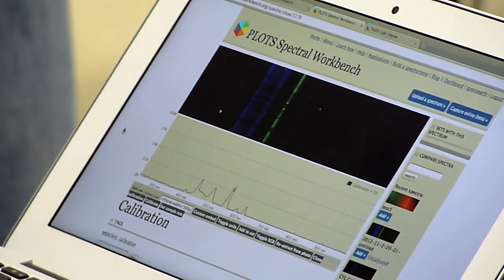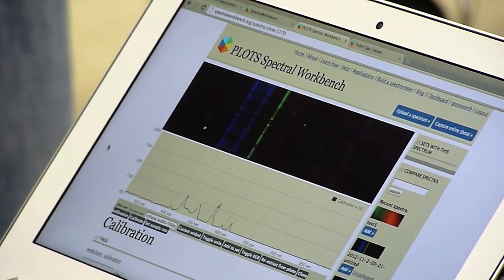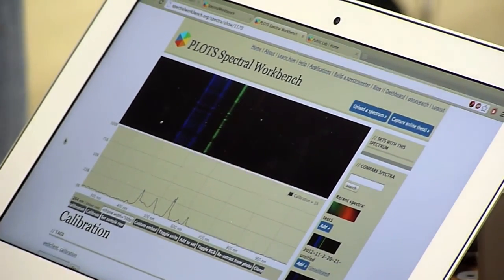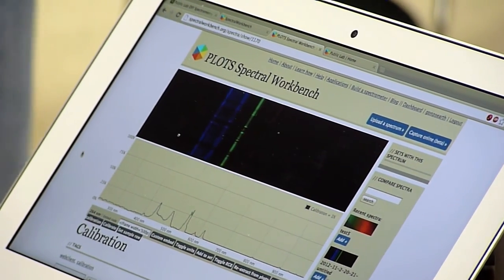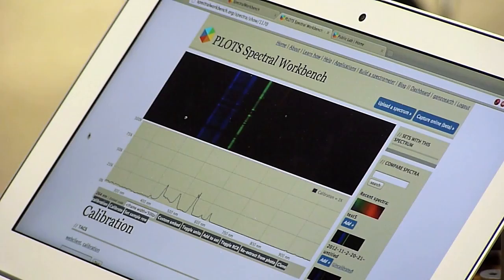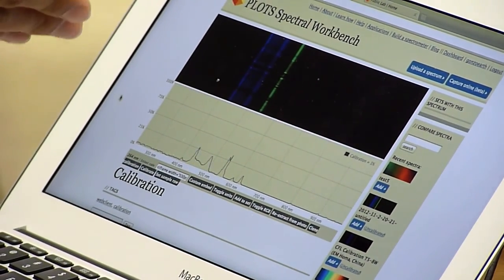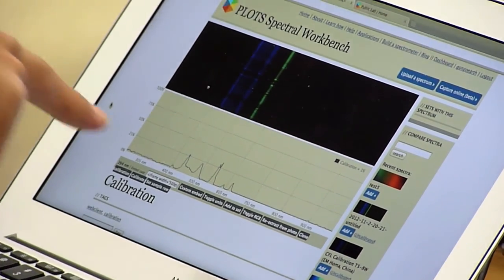So what would be sloppy about the way it was built? That makes that have 2 peaks? I don't know. I haven't seen that on other ones that I've made. Maybe the slit has, maybe a reflection. Yeah, reflection off the slit. Something like that. So what happened now is it refreshed, and now there's a scale bar.